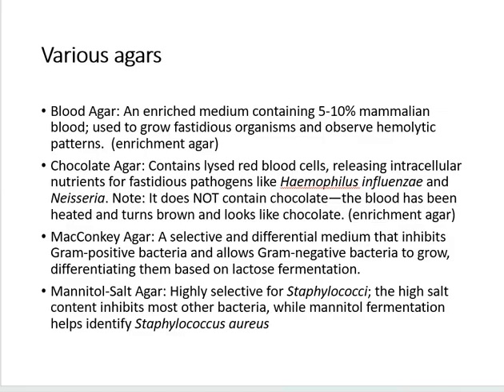And that becomes important when you talk about streptococcus, and we'll get a whole lecture on this, and we'll look at these hemolysis patterns towards the end of the course. But a beta strep means that the red cell is completely lysed and the hemoglobin is completely degraded. And that tells us a lot about the organism. So using a blood agar will allow us to grow most of these guys, but at the same time, observe if there's a hemolytic pattern.